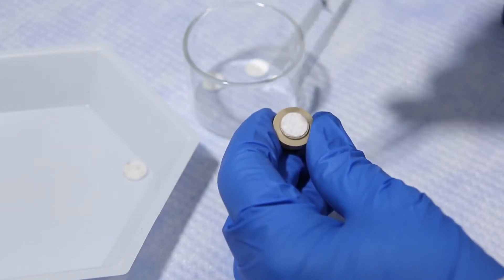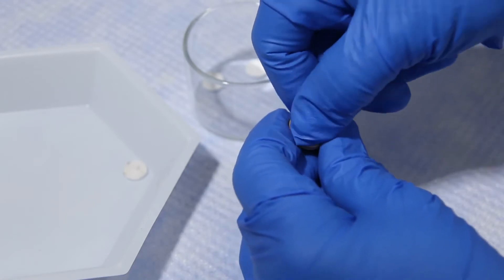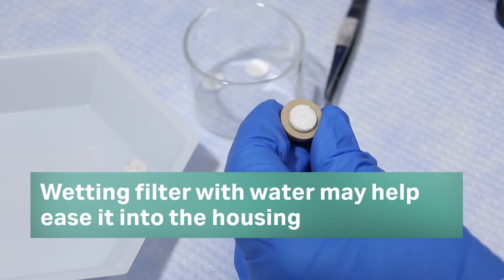Place the new filter in the housing. It is important that the filter is well seated in the holder. Wetting it with water may help the filter ease into place.